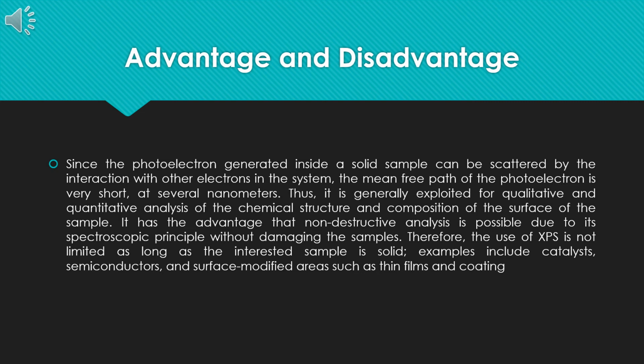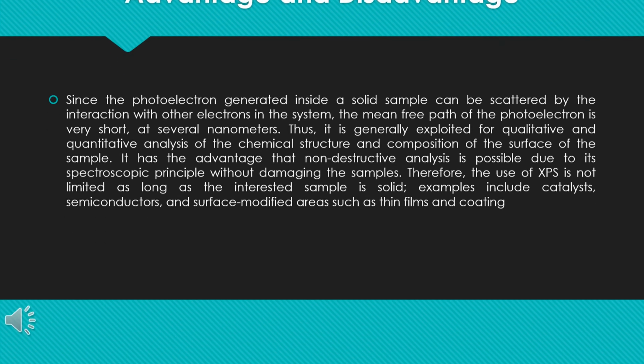As mentioned before, XPS is a non-destructive technique able to estimate the atomic percentage, hence quantitative analysis, per element and determine the chemical state of several materials such as metals, metal alloys, polymers, ceramics, and organics.